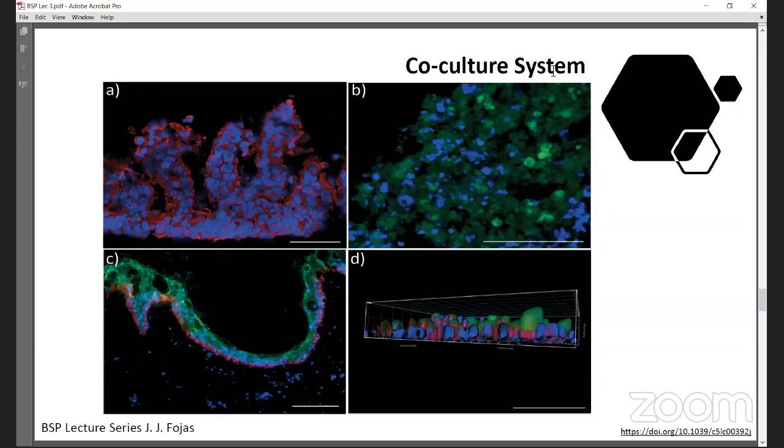So here you can see image A, so that's red, that's CTK19 expression in your small intestinal epithelial tissue. Yeah, that's so cool, intestinal epithelial tissue. And then you have the green ones. Whenever it's fudgy and muddy, it reminds me really of liver, which in this case is a liver aggregate. So that's here. And then you have an epidermal marker, CTK10 green on your C image. And then you have the red one, your CTK15. This is for your skin biopsies.